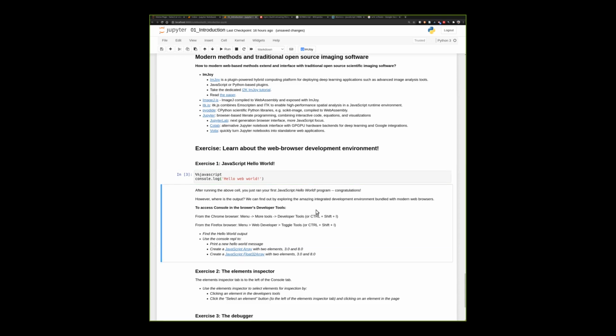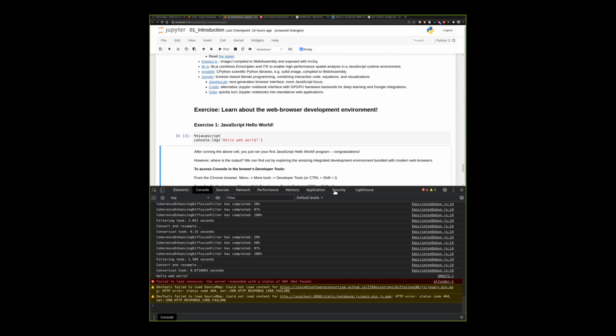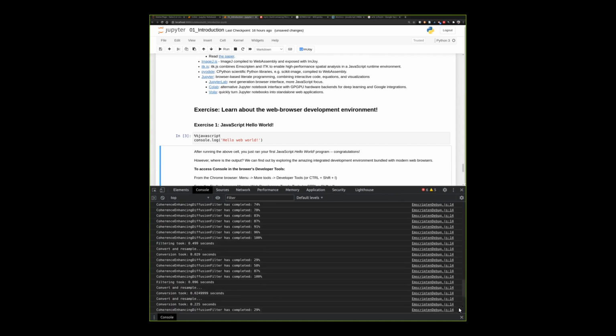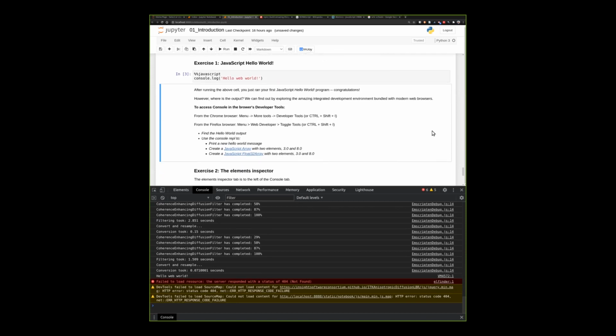It went into your browser's developer tools. Chrome and Firefox and Edge all come with very nice developer tools built into every browser that you download. You don't have to do anything special to install it. So open that now in your browser. On Chrome, you can go to the menu up top, select More Tools, and then Developer Tools. Firefox is similar. Control-Shift-I is the shortcut.